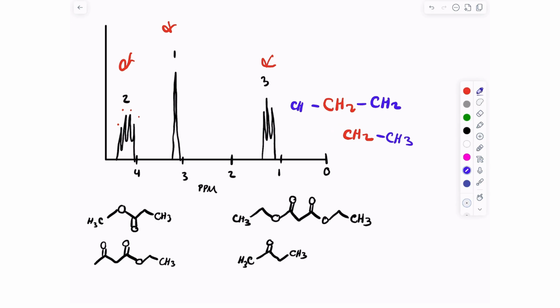But this is really what I think it is, because I'm seeing now that there does seem to be an ethyl pattern here. So I think it is an ethyl. But let's just draw it out. We've also got a triplet with an integration of 3, so it's going to be a CH3, CH2. That just eliminates this. It's not going to be this because this is a clear ethyl.